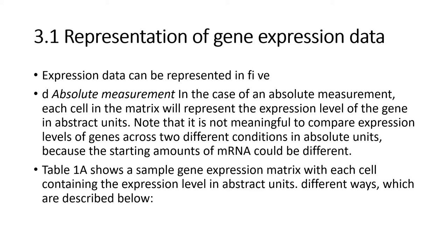Welcome to the class of Microarray Data Analysis. Dear students, today we are going to learn about how we represent the data, gene expression data.